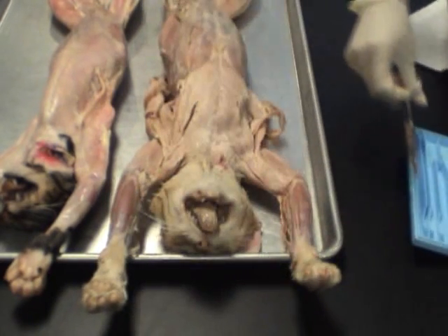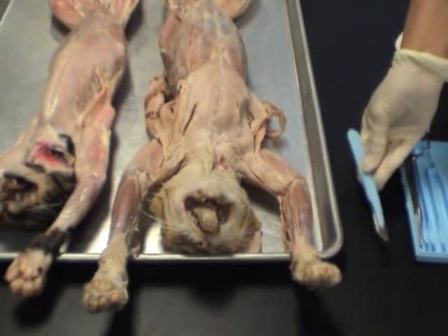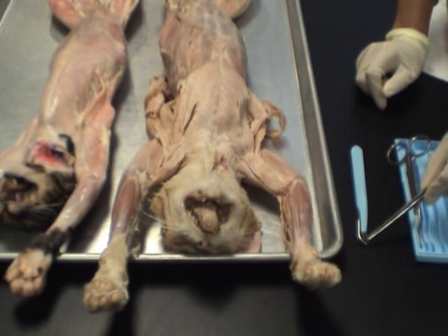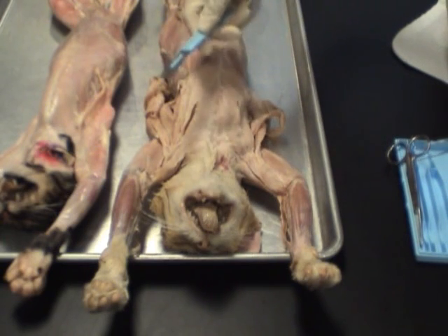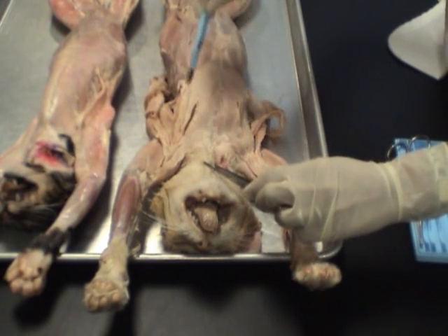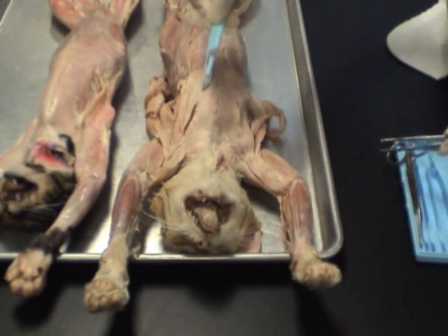Okay? And lastly, we have the scalpel. Okay, this is a scalpel. As you can see, it has a very, very sharp blade and the handle. So to hold the scalpel is this way, and you're going to cut obviously with the sharp end toward the area of interest.